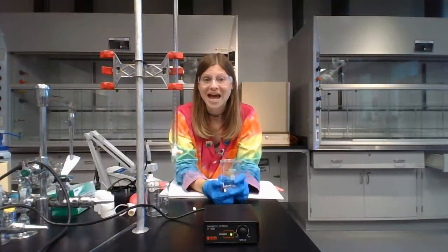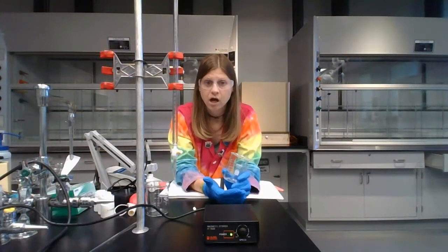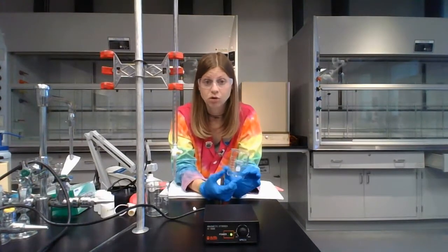The unknown weak acid is already in solution form, so we don't need to measure it out as a solid. It's already in a solution form, which means we have to pipette it accurately into our beakers.